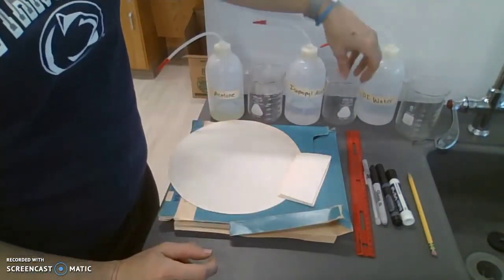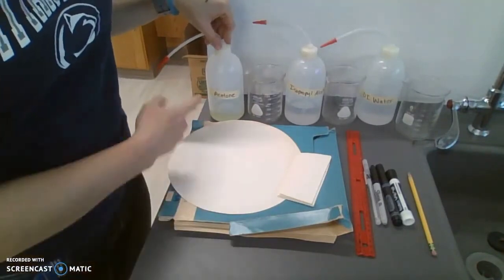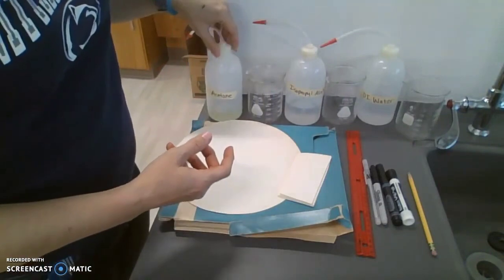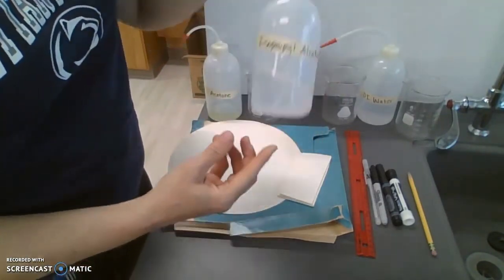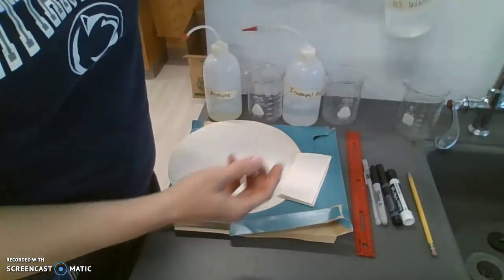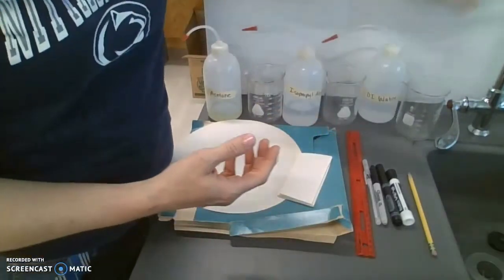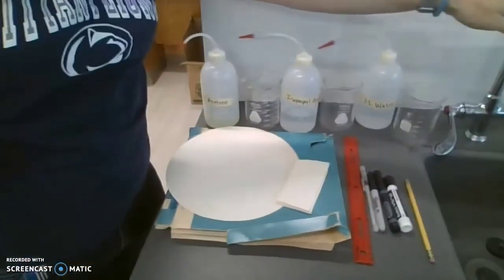We have beakers. We have the solvents of acetone, which is the chemical name for nail polish remover. We have isopropyl alcohol, which is the chemical name for rubbing alcohol. And deionized or distilled water, which is pure water, not the same stuff as from our tap or sink.